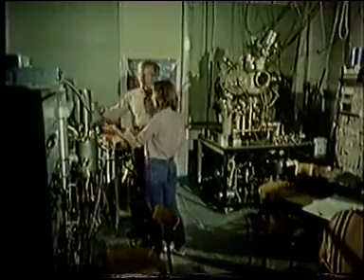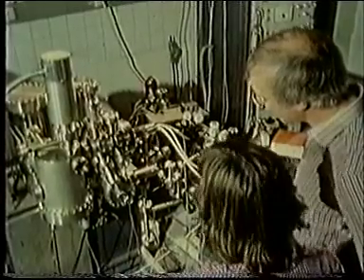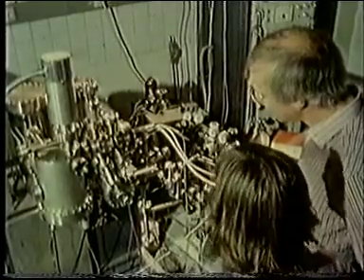So Professor Ertl's first work was done on clean iron surfaces cut from single crystals. Because he knew that nitrogen adsorption contained the rate-limiting step, he was soon trying to establish the chemical state of nitrogen adsorbed on iron surfaces. This can be done by X-ray photoelectron spectroscopy. XPS tells us about the binding energy of the core electrons in the adsorbed nitrogen.